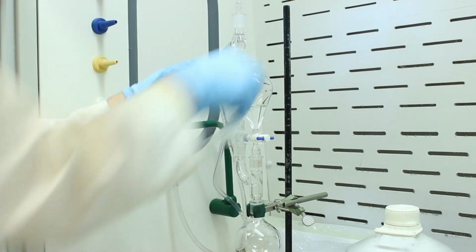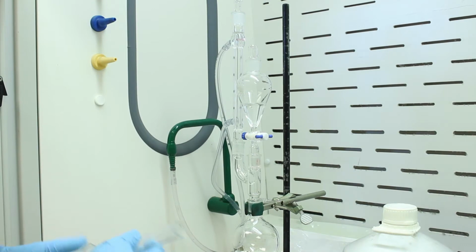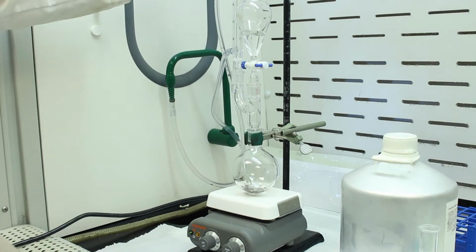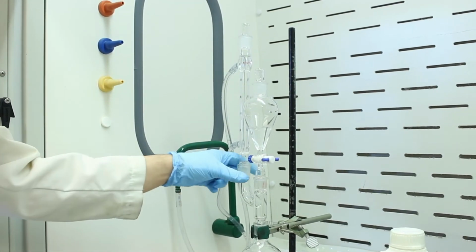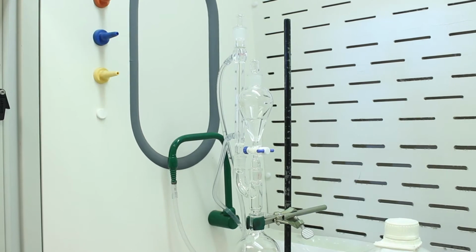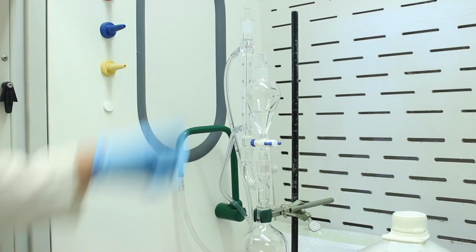If you look closely, you can even see the refractive index of it, see the vapors kind of flying out. Okay, and we'll stopper it. Okay, so also we're keeping the apparatus stoppered for now. So typically you never want to heat or work with a sealed reactor just in case something explodes. But here we're concerned about keeping water out, water vapor in the air out.